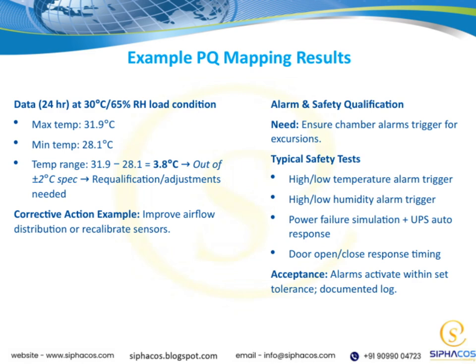Alarms must activate within the predefined tolerance limits, and we document all the logs thoroughly. This documentation is vital for verifying compliance and for future troubleshooting.